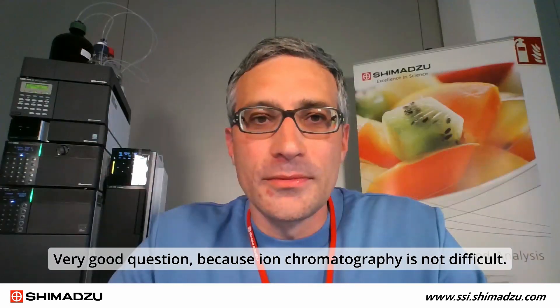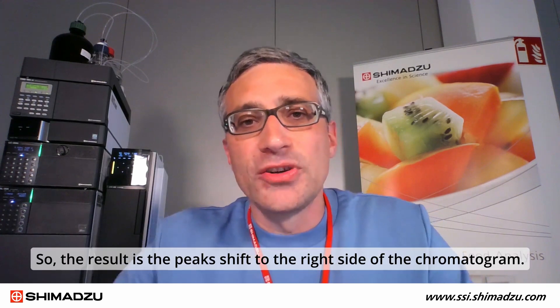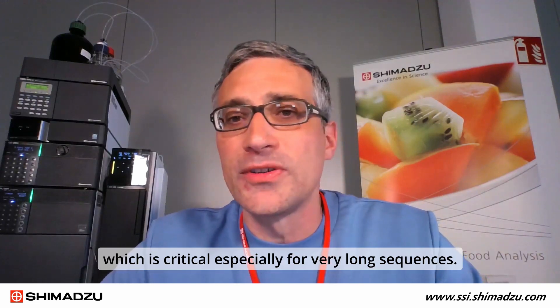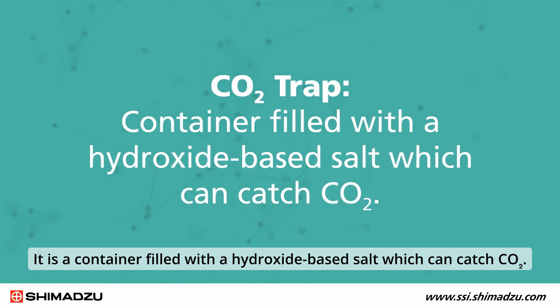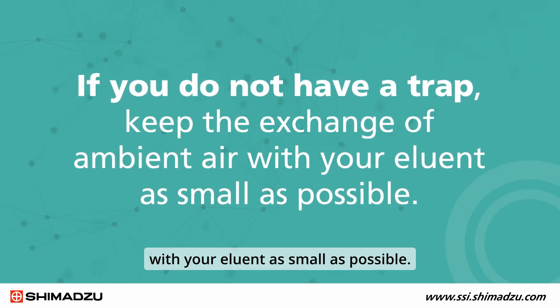Ion chromatography is not difficult, but it is worth mentioning the CO2 trap. CO2 — carbon dioxide gas from ambient air — can easily be introduced into non-protected carbonate-based eluents, making them more acidic. This causes a higher concentration of bicarbonate ions in the eluent, which makes the total eluent strength lower, resulting in peak shifts to the right side of the chromatogram, and non-stable retention times — which is critical, especially for very long sequences. You can protect your eluents with a CO2 trap, which is a container filled with a hydroxide-based salt that can catch CO2. If you don't have the trap, try to keep the exchange of ambient air with your eluents as small as possible.